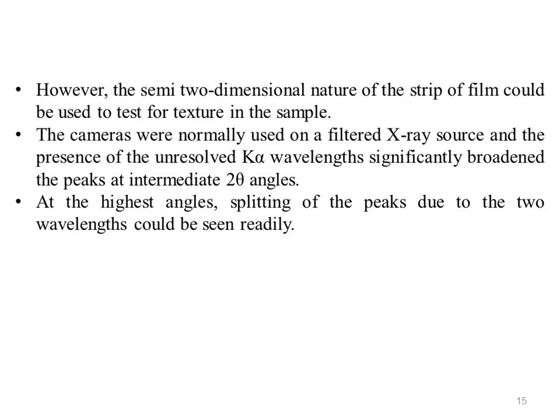The cameras were normally used with a filtered X-ray source, and the presence of the unresolved K alpha doublet wavelength significantly broadened the peaks at intermediate 2 theta angles. At the highest angles, splitting of the peak due to the two wavelengths could be seen readily.